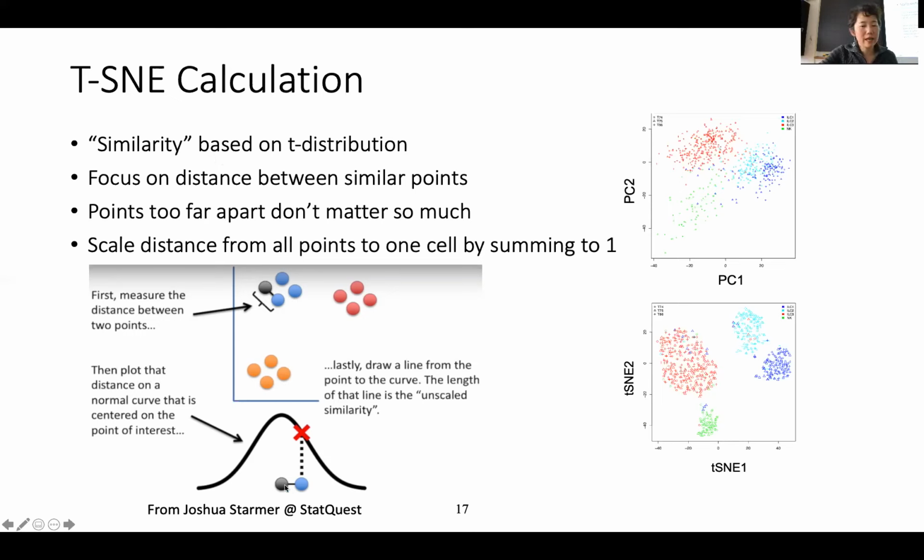So initially, you might want to calculate how much is the correlation, and then you convert the original distance into a T distribution, and you remember T is where you subtract and divide by the standard deviation.